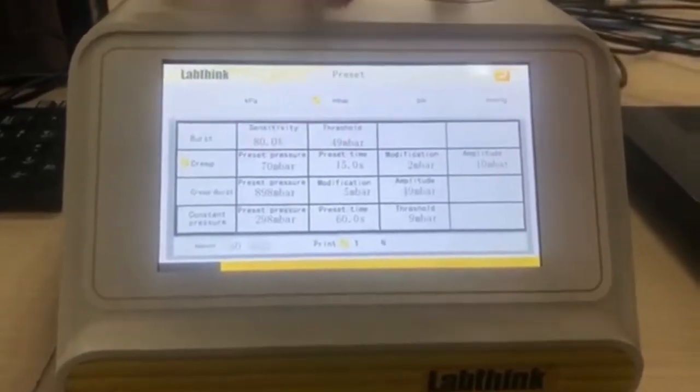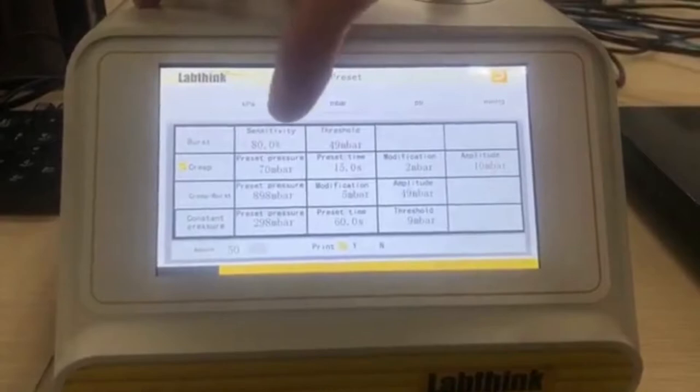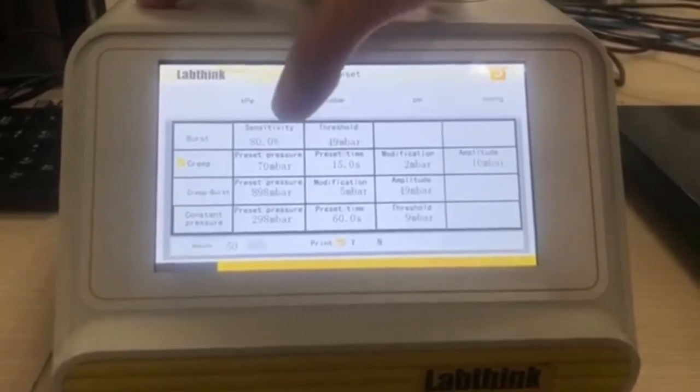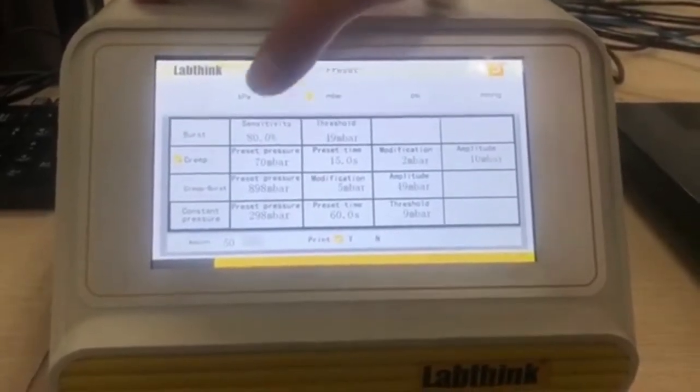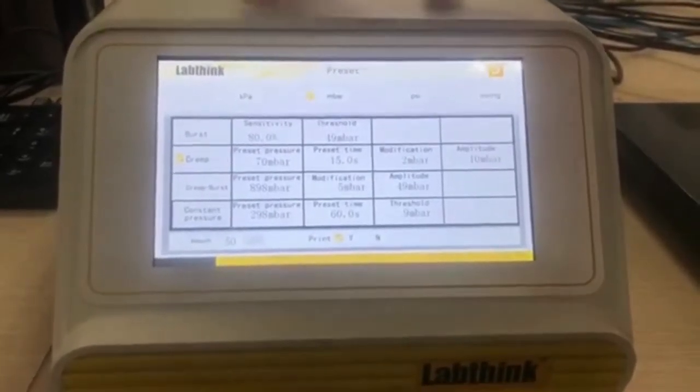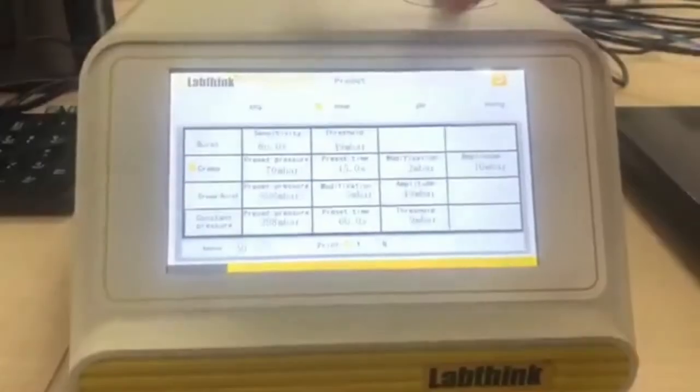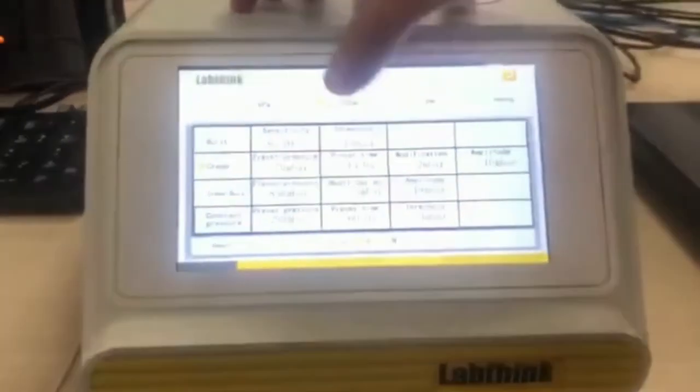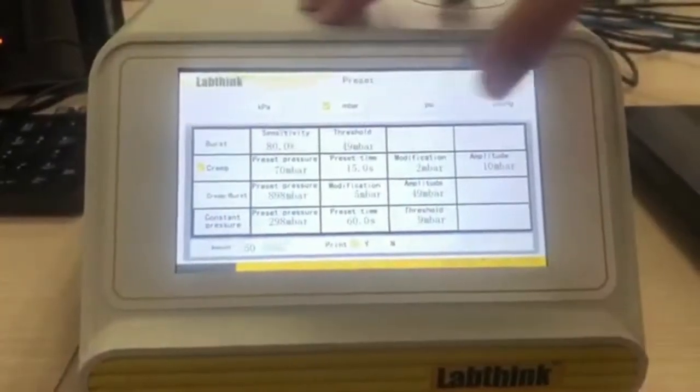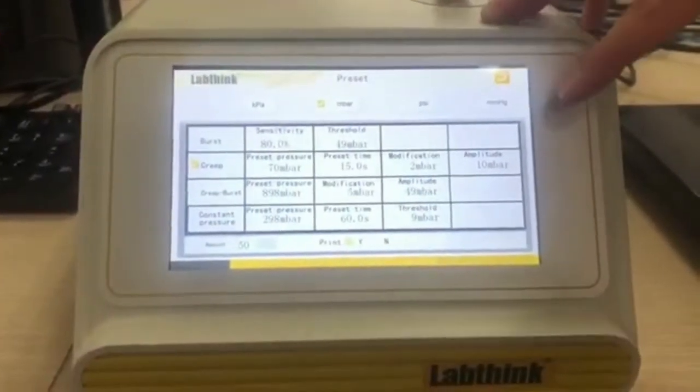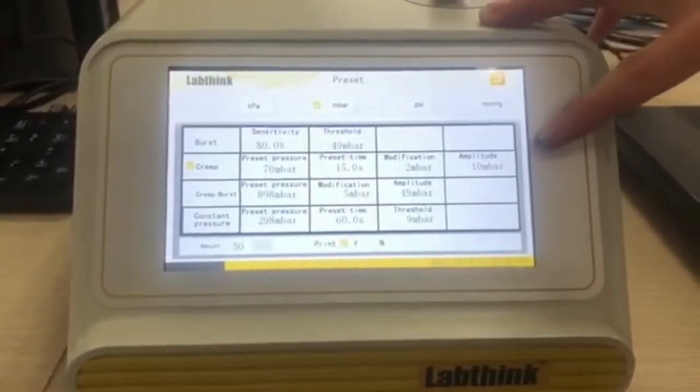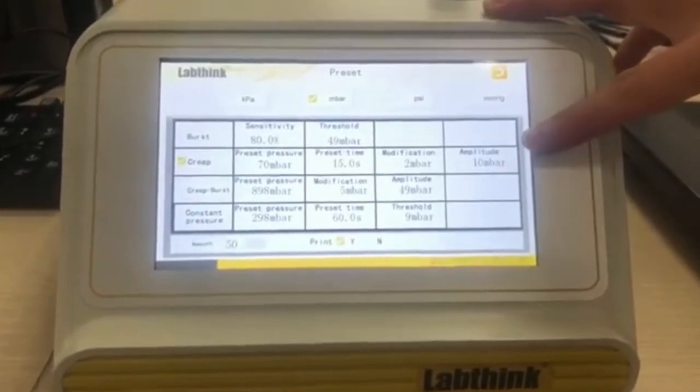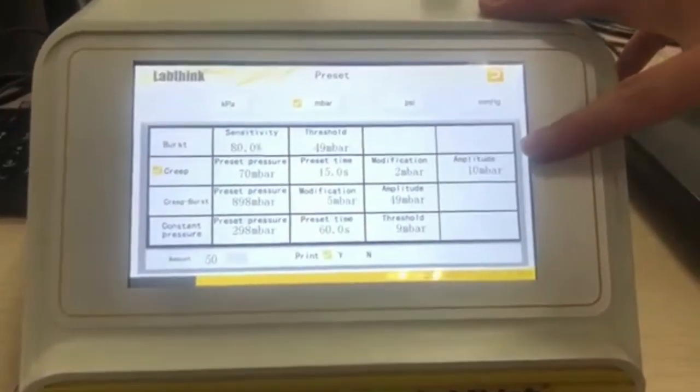Here I set the preset pressure as 70 millibar and the preset time is 15 seconds. Here also, there is another important parameter called amplitude.